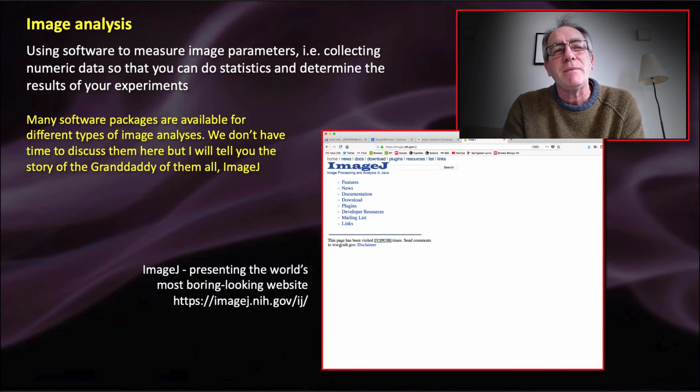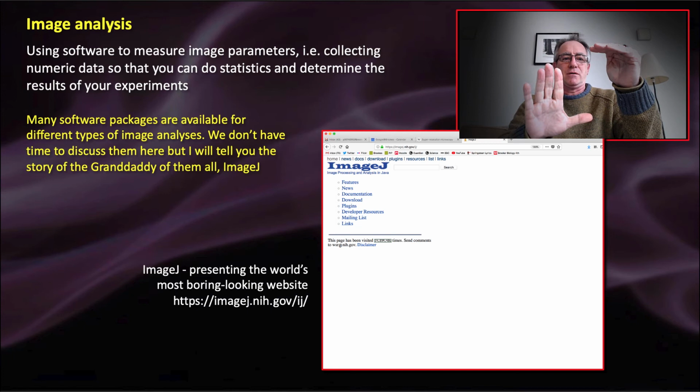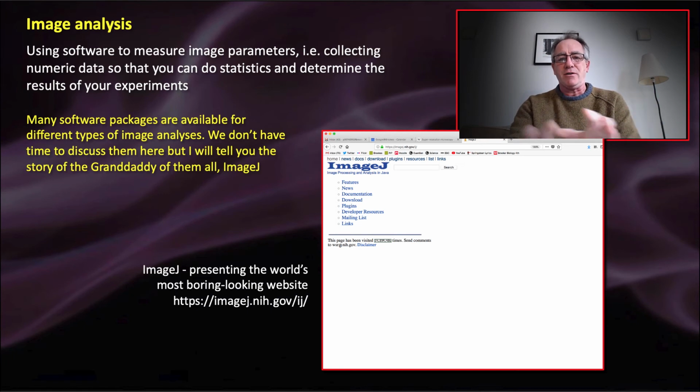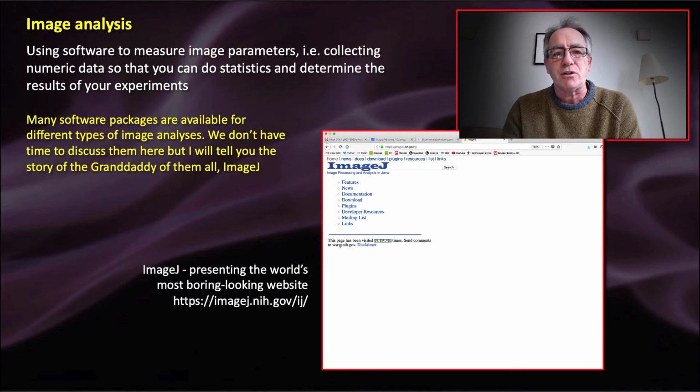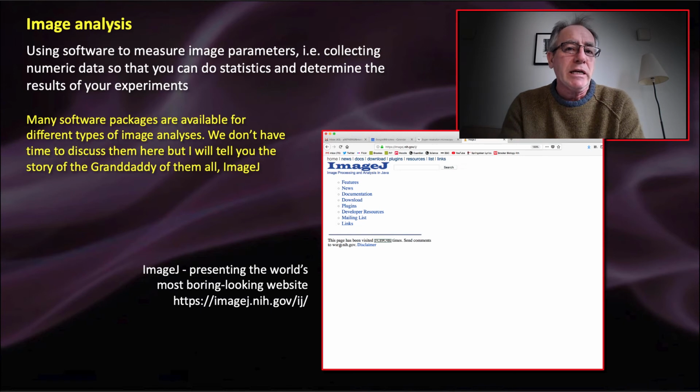But anyway, let me set the scene a little bit here. Consider a black and white image taken of a group of cells. I don't have it. What I should do is get these couple of images and put them up on the screen. I hope that helps you. But a black and white image taken from above of a bunch of cells growing on a petri dish. Sitting beside it on your computer screen, another black and white image of the surface of the moon with a whole bunch of craters. You've got those two pictures. They actually look, to the untrained eye, relatively similar. Black and white image with a bunch of little circles in it.